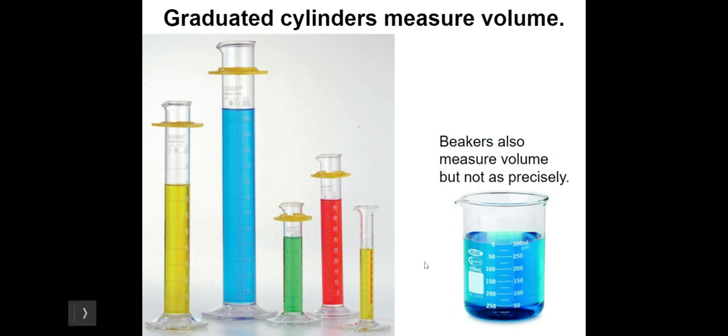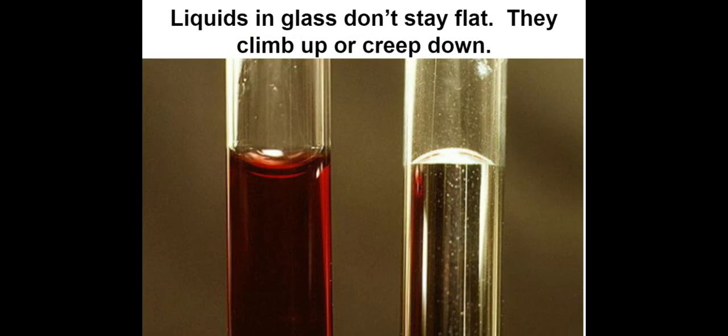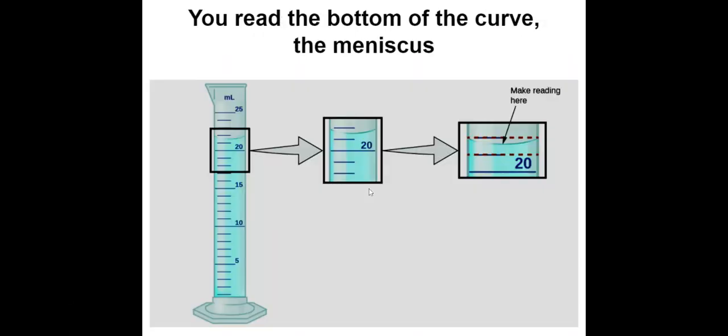So graduated cylinders, we're going to go in depth on that a little bit more, because they're a little bit tricky. Here's some reasons why. Liquids in glass don't stay flat. They tend to climb up the sides or kind of creep down the sides. So you get this bowl shape, or you get sort of a dome shape. And mostly what we're going to see is a bowl shape, because that's what water-based things do. You read the bottom of the curve, and that's called the meniscus. So the bottom of that little bowl shape, that's where we're saying where to read that, right at the bottom of the curve.